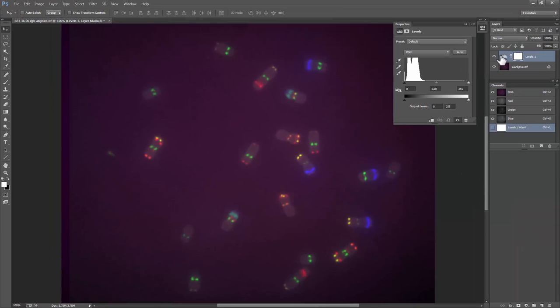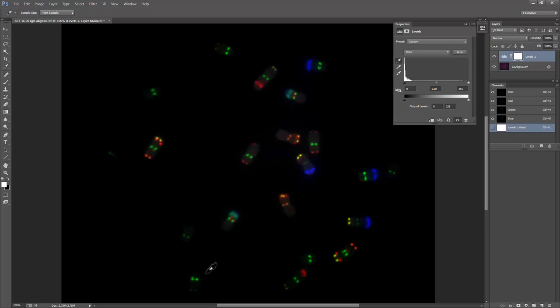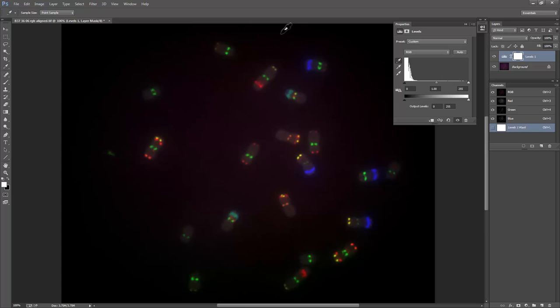The black point eyedropper is selected, which is used for sampling candidate black set points. The subtraction is based on the individual red, green, and blue values of the sampled pixel. Trying to remove all of the background may result in a loss of information, as can be seen on the lower left chromosomes. Other pixel locations must be sampled to find an acceptable level of background reduction.